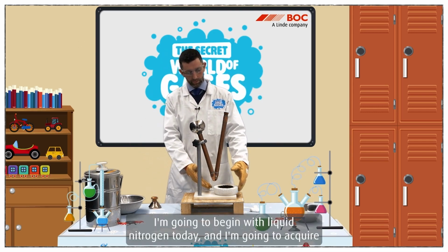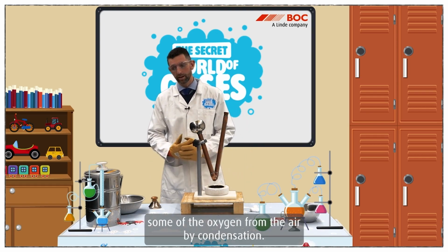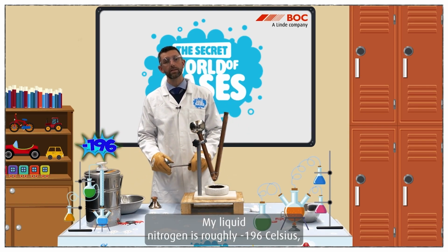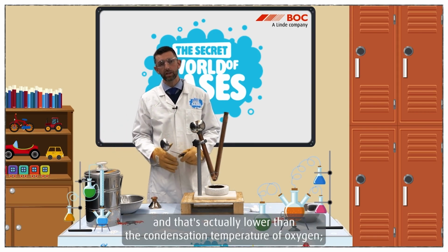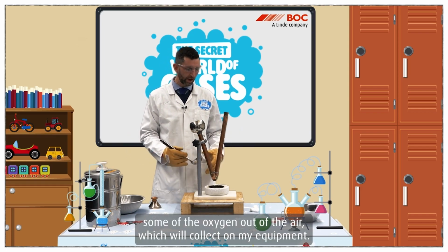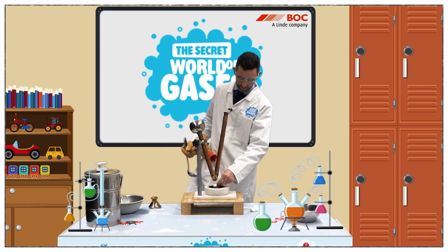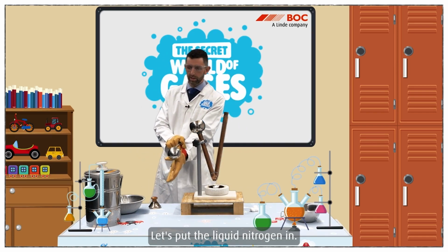So I'm going to begin with liquid nitrogen today, and I'm going to acquire some of the oxygen from the air by condensation. So my liquid nitrogen is roughly minus 196 Celsius, and that's actually lower than the condensation temperature of oxygen. So that's going to help me condense some of the oxygen out of the air, which we'll collect in my equipment. So I will be collecting it in a cotton bud, which we'll place underneath the equipment. Let's put the liquid nitrogen in.